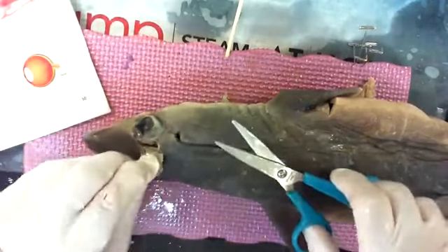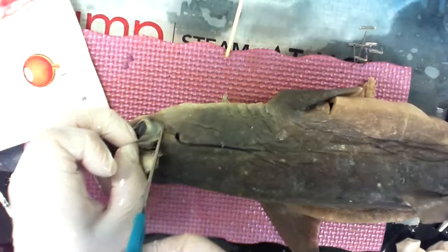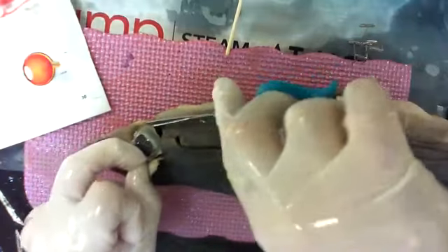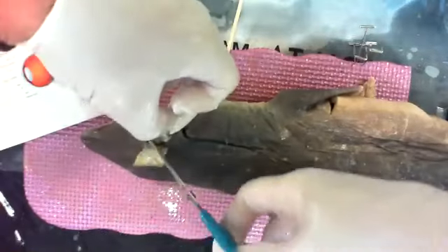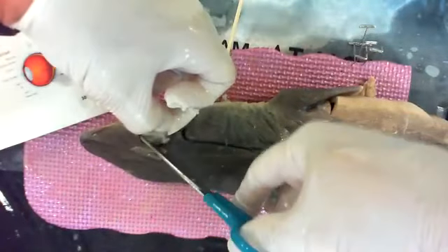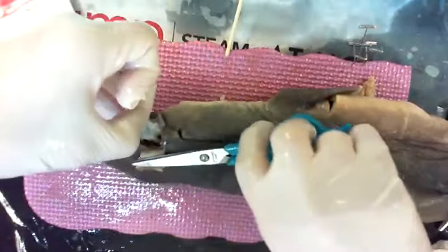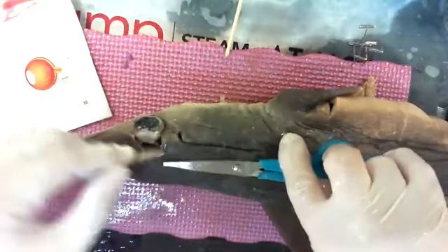So peel that back. You can take your tweezers if you want. I'm using my fingers because it gets me closer. And I'm just cutting right around the eyeball. So I'm cutting that conjunctiva and the eyelid on the bottom. Don't want to cut muscles, so I'm really trying to avoid it. Snip. I know it's going to happen. So now really the only thing holding it in are those muscles and the optic nerve, which is the nerve that sends the signals to the brain that comes off the eyeball.